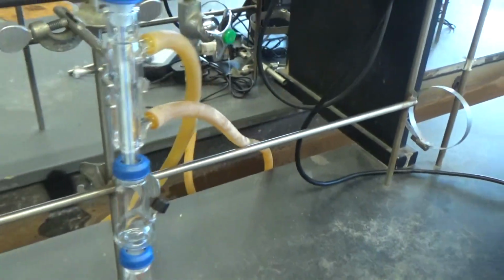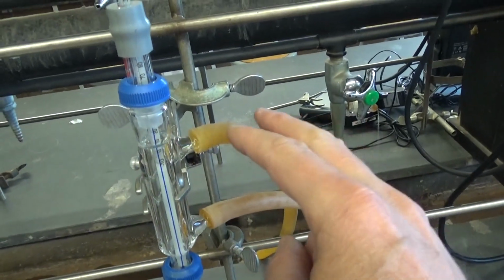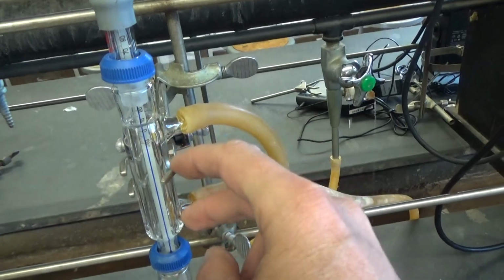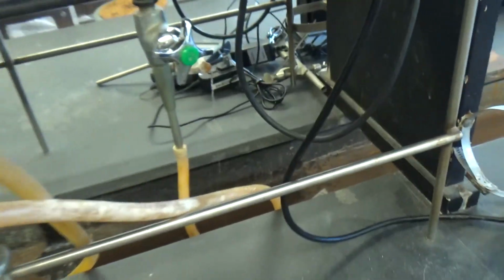Out at the top. And just to be clear, why do you do that? Because if you pump water in from the bottom, it will fill up and then go out the top. If you put water in from the top, it just shoots down and then it doesn't really coat the inside of the condenser very well. So this is just a general trick with condensers.